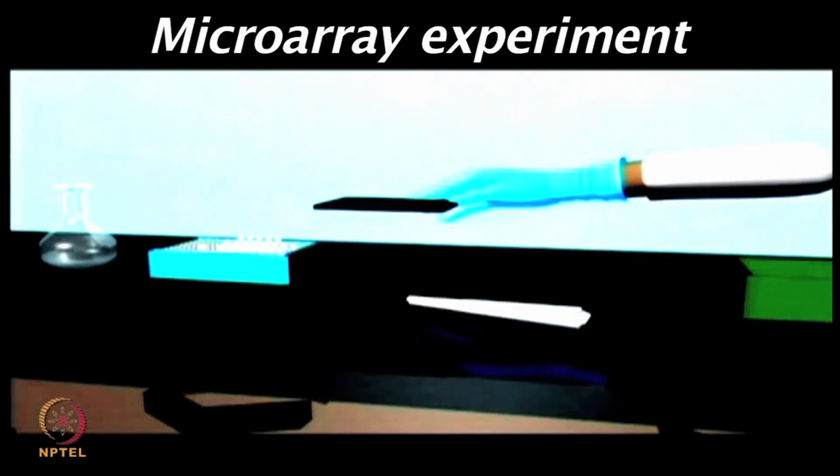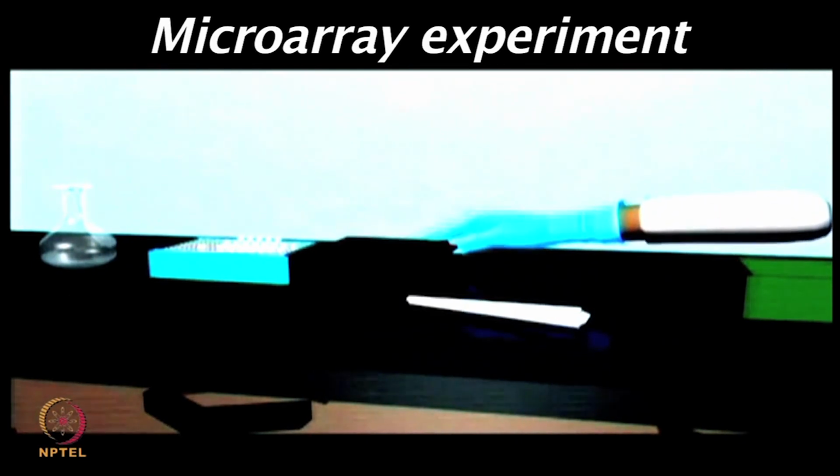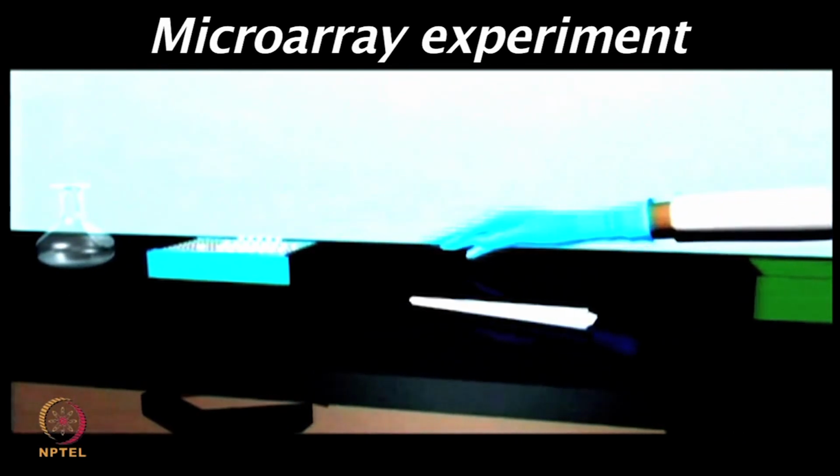You need to place the cover slip to avoid any dust or other particles on the chip surface.